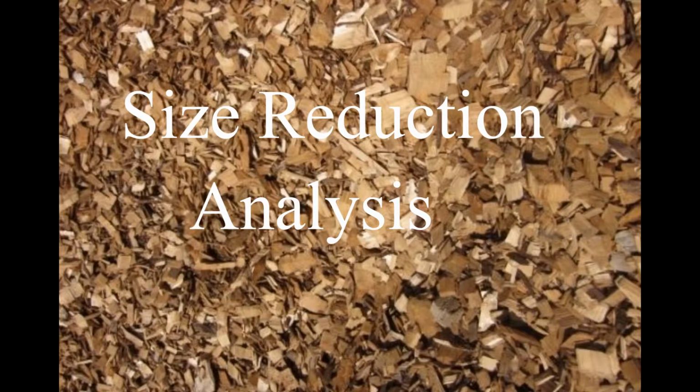Particle size analysis is used to gather information such as the size range, average size, or mean size of the particles in a sample. This is used to create various weighted averages in biomass processing industries. Distribution of particle sizes can be done in a variety of means, with the most common being to shake the biomass particles through a series of sieves and measure the mass distribution. Assuming a shape and density to the biomass particles, a size distribution can be generated.